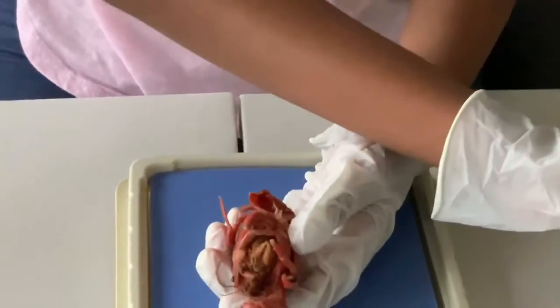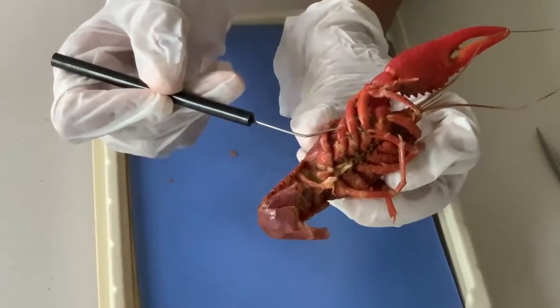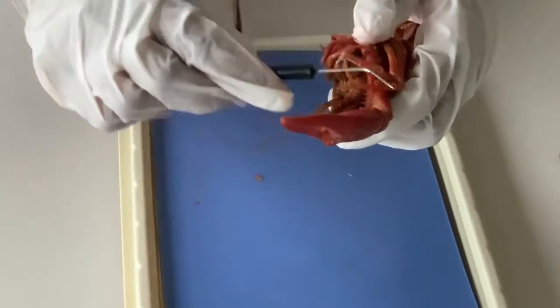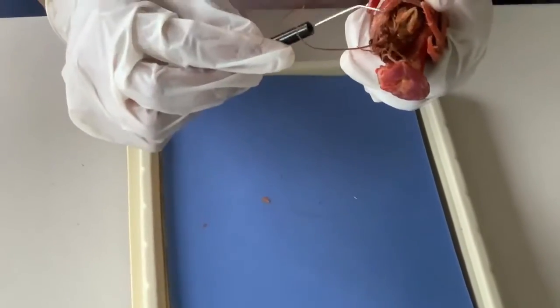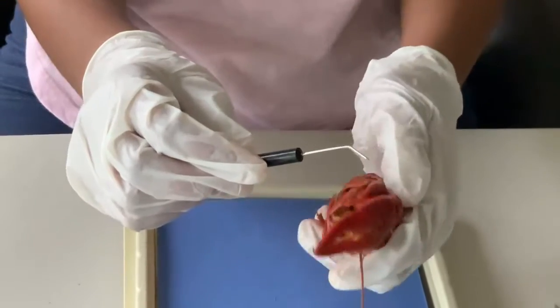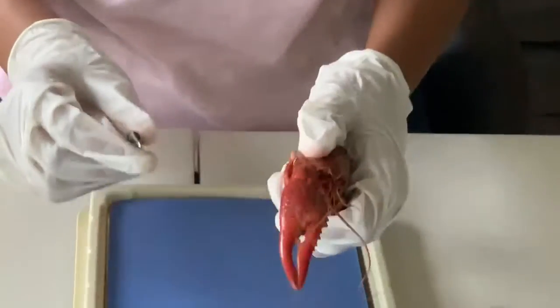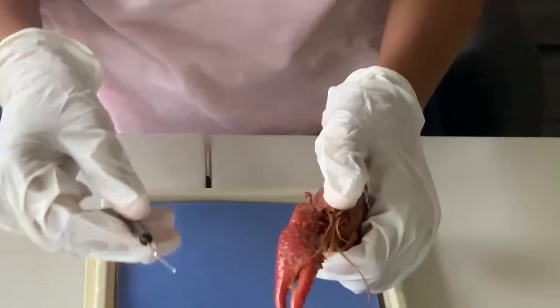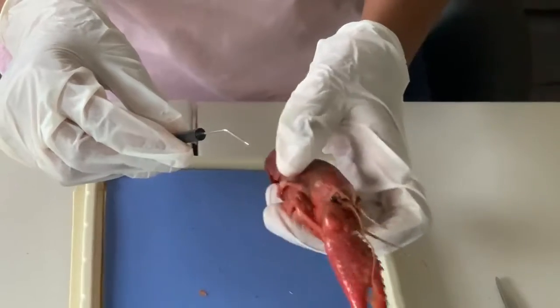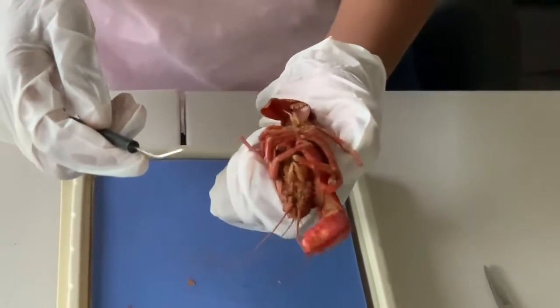Crayfish have four pairs of walking legs over here — you can see them. Crayfish also have two legs here; one of mine is cut off, and these are modified legs called chelipeds. Chelipeds have three uses: they are used to catch prey, to defend themselves against predators, and to cut food. The four walking legs are used to walk around.